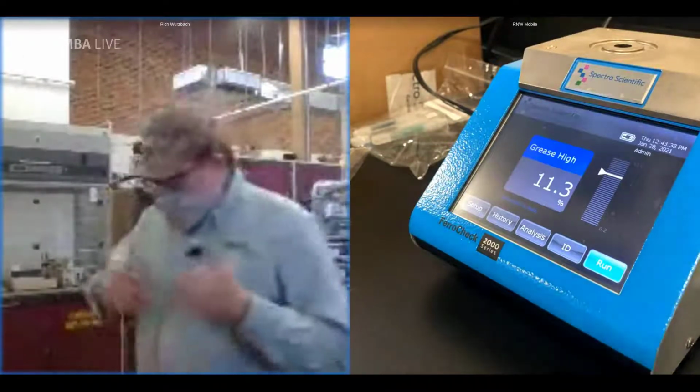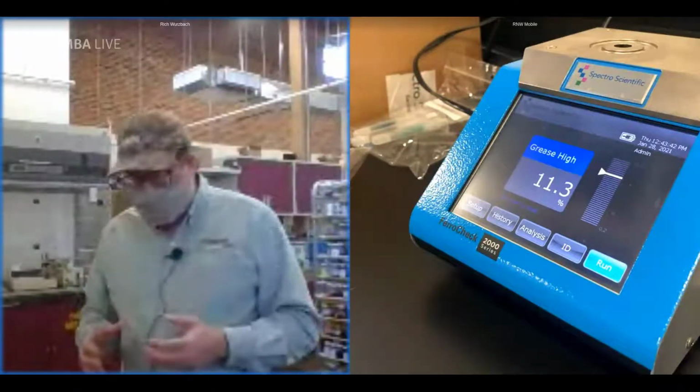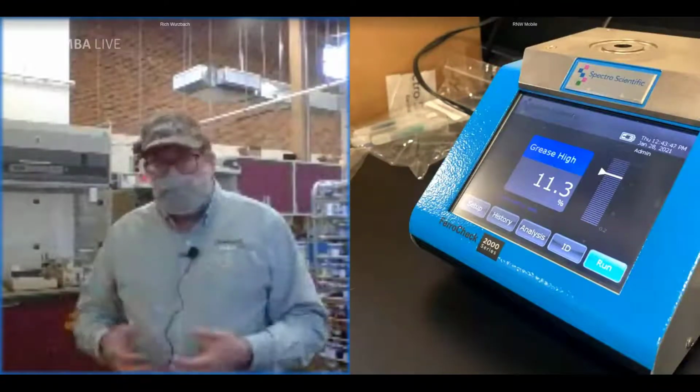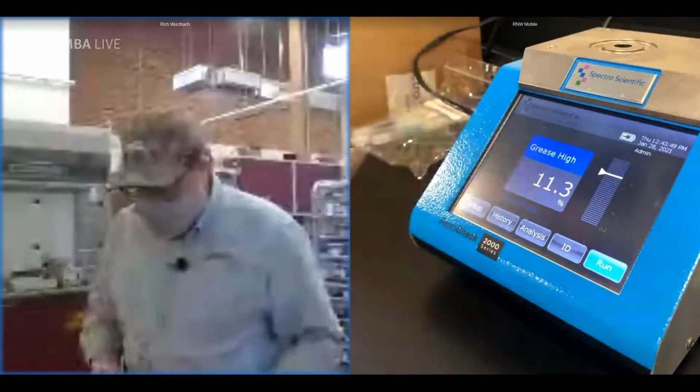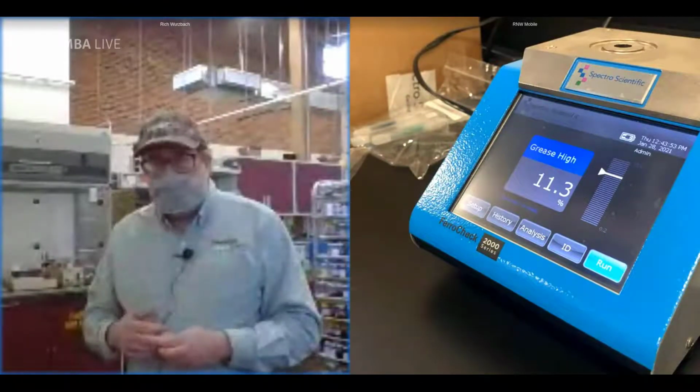So this is the process that I wanted to share with you today, which is a fairly simple process, which is just that ferrous measurement, giving us a single number, parts per million, perhaps with this device a percent above a certain value. So we'll handle those values.